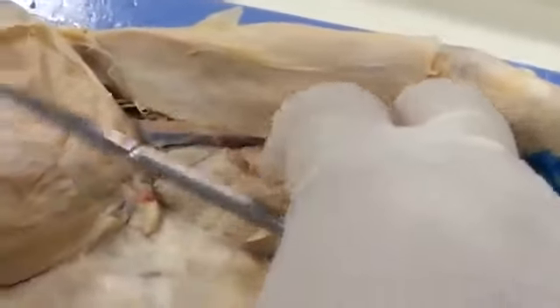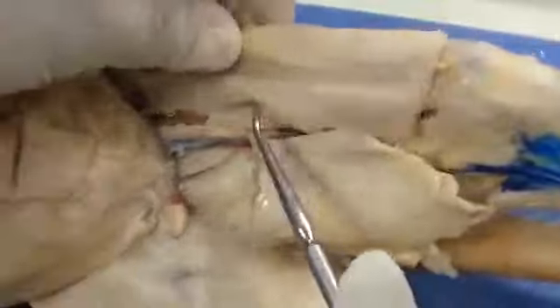Moving down to the leg, starting with the superficial muscles that we had, initially covering all of the muscle groups here, you had the sartorius, the band-like sartorius, and the gracilis on the medial aspect. Now for the sartorius, this is going to allow you to laterally rotate the knee or abduct the knee, as well as bend the knee. And the gracilis is going to help with knee flexion as well. So those are the superficial muscles.